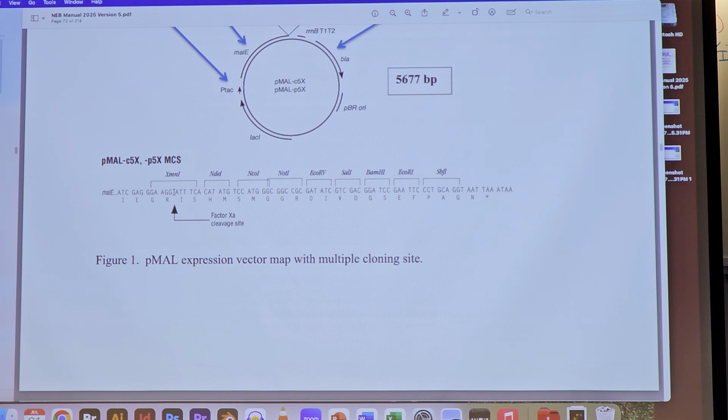Well, there are nucleases around, and if our vector or our cDNA lost a nucleotide or two at the end, then our reading frame is going to be off. Have I ever seen that? Yes, I've seen that. But we don't see it often, unfortunately. So usually it goes together properly, but we'll see that when we get our sequence results.